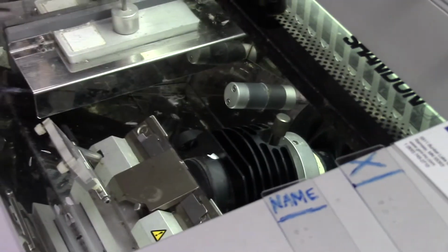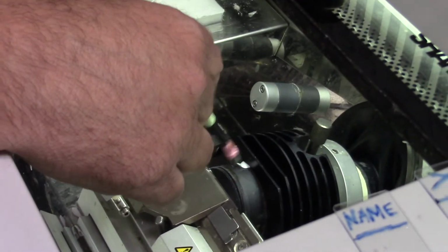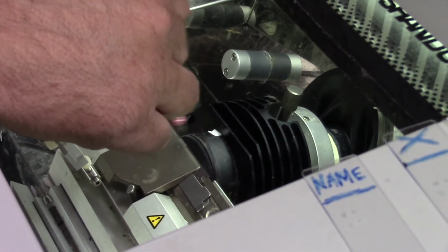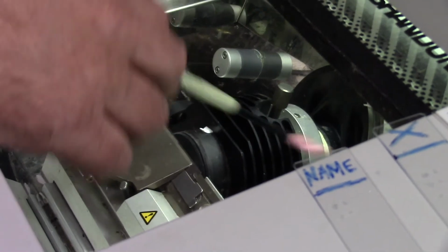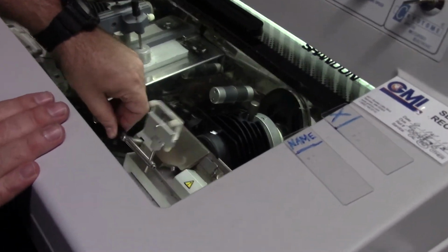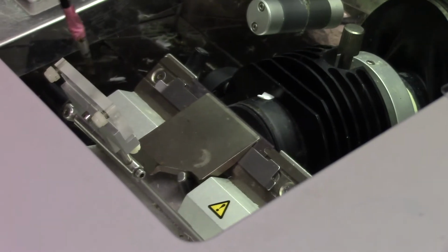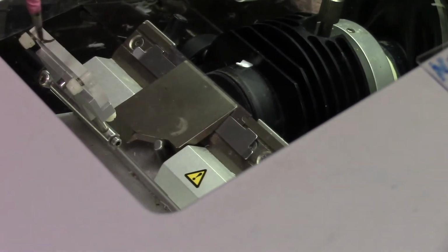So clearly there are too many snowflakes, too much frozen material stuck on my tray here, so I've got to get rid of all that so that the next section will come off much cleaner. Oh, you know what? I think I saw a little snowflake right up on the top of here too. I sure did. That could have been the one that was the problem.